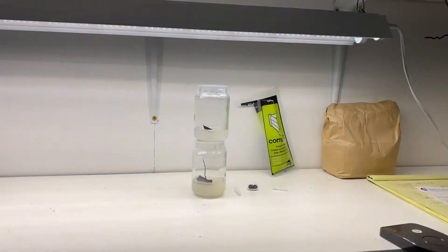Not sure if we're going to cut it up today or wait until another day, but I haven't looked at it recently, so you guys will be seeing it for the first time with me. I'll get you flipped around and we'll see what kind of growth we've got.